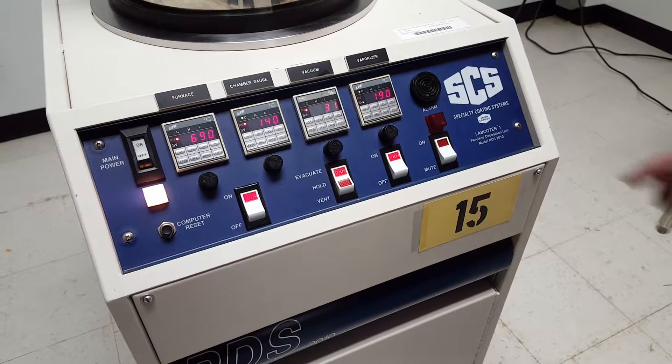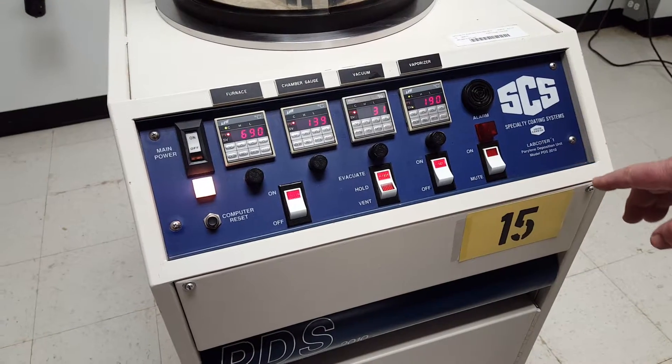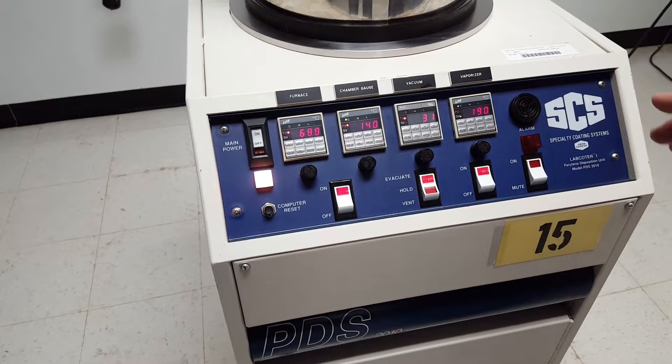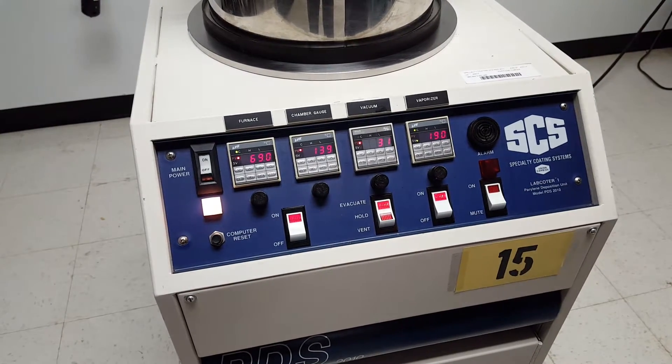This demo is for the SCS Specialty Coating System, Lab Coater 1. It's a Parylene deposition system. I can't really run the process on here because the way this works is the Parylene has to evaporate and put pressure on the system.